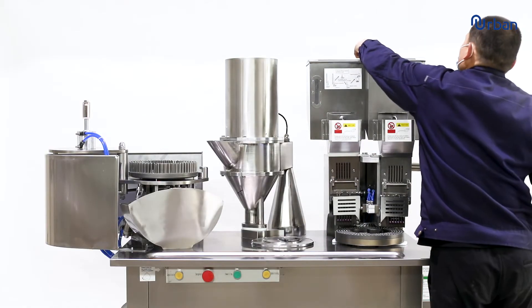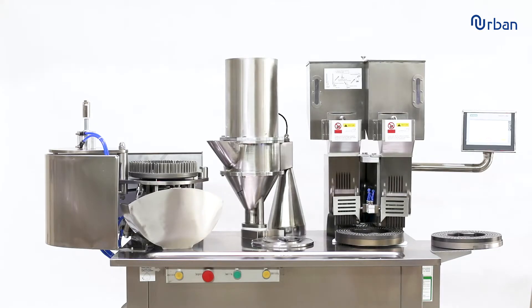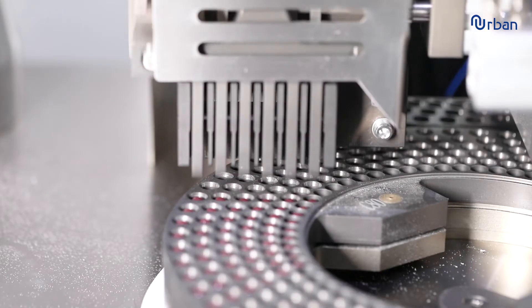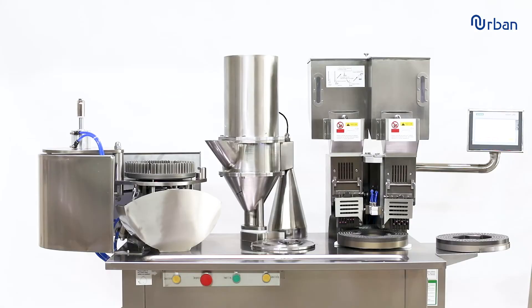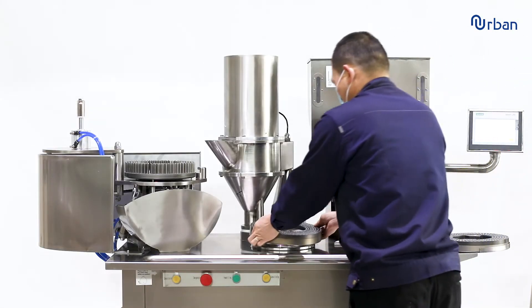The Doublehead Semi-Automatic Capsule Filling Machine is a device for filling empty capsules. It can handle capsule sizes from 000 to 5, with speeds up to 50,000 capsules per hour.